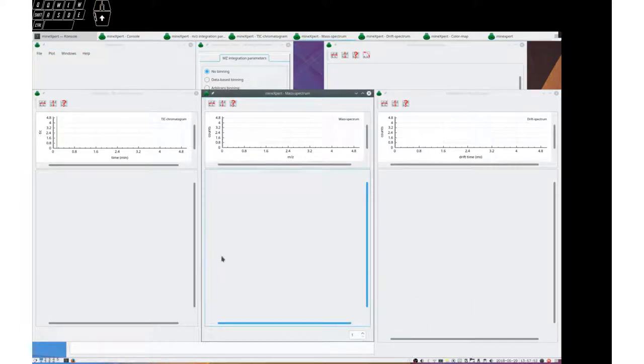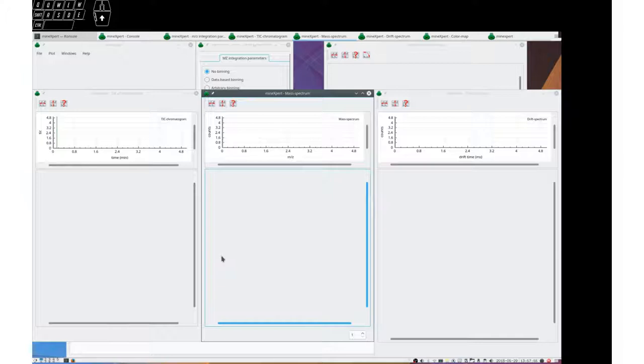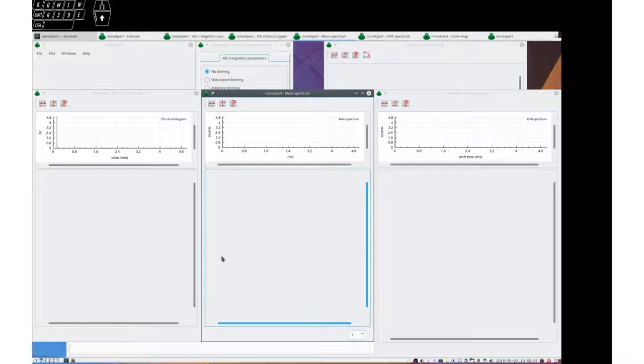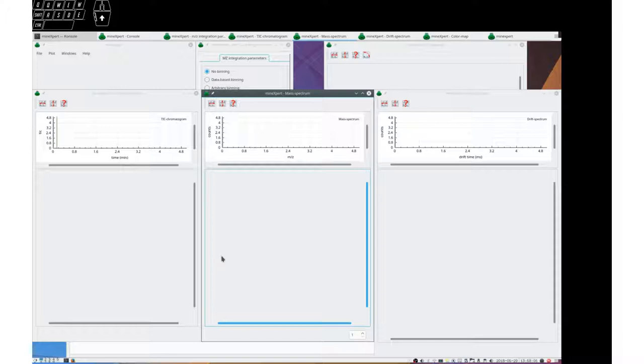Greetings everybody. This tutorial is about performing integrations, mass spectral data integrations, in the MindExpert program of the MS Expert Suite software environment.